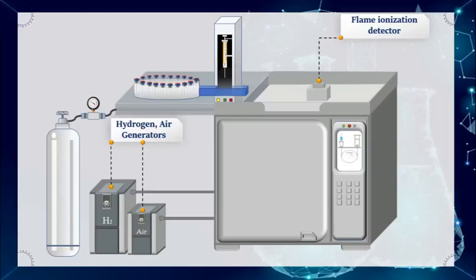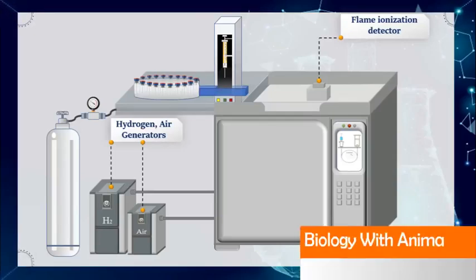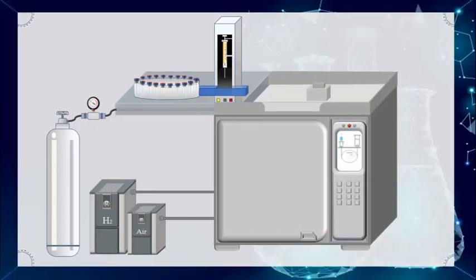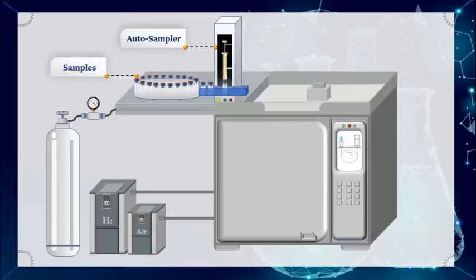system. The flame ionization detector is almost universally employed, where the flame commonly is generated with hydrogen and air. The auto-sampler provides the means to introduce a sample automatically into the inlets. Also, manual insertion of the sample is possible.